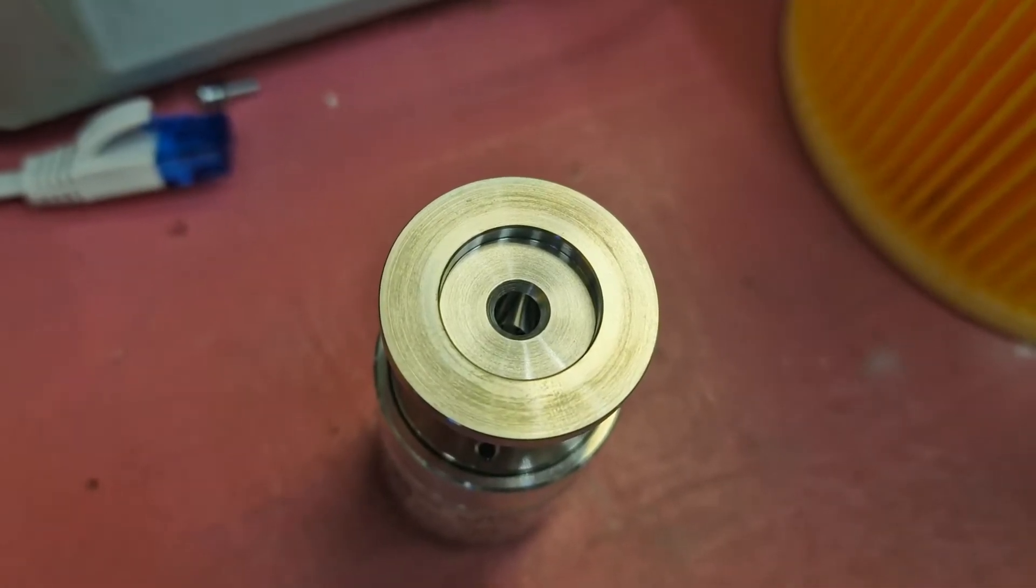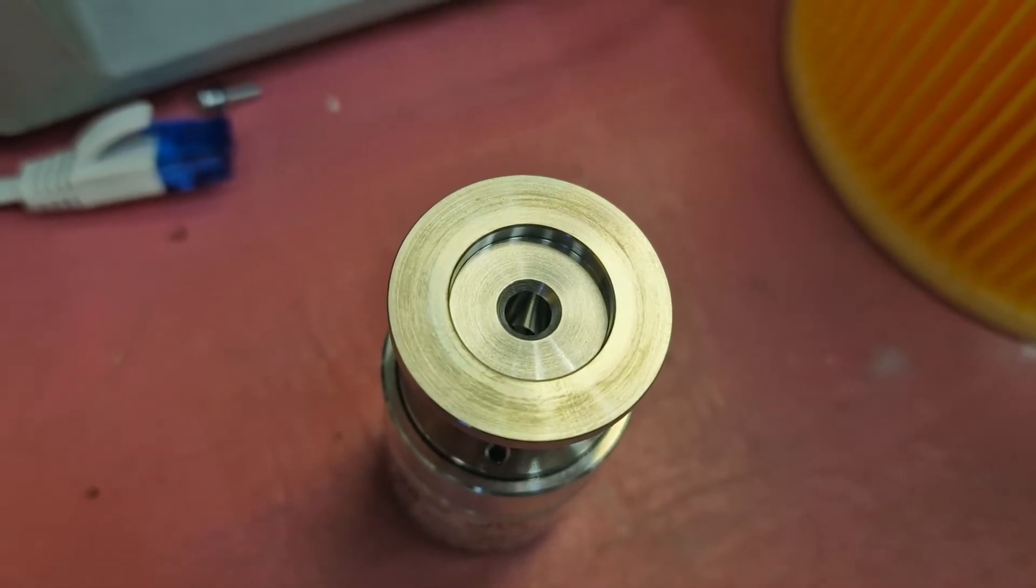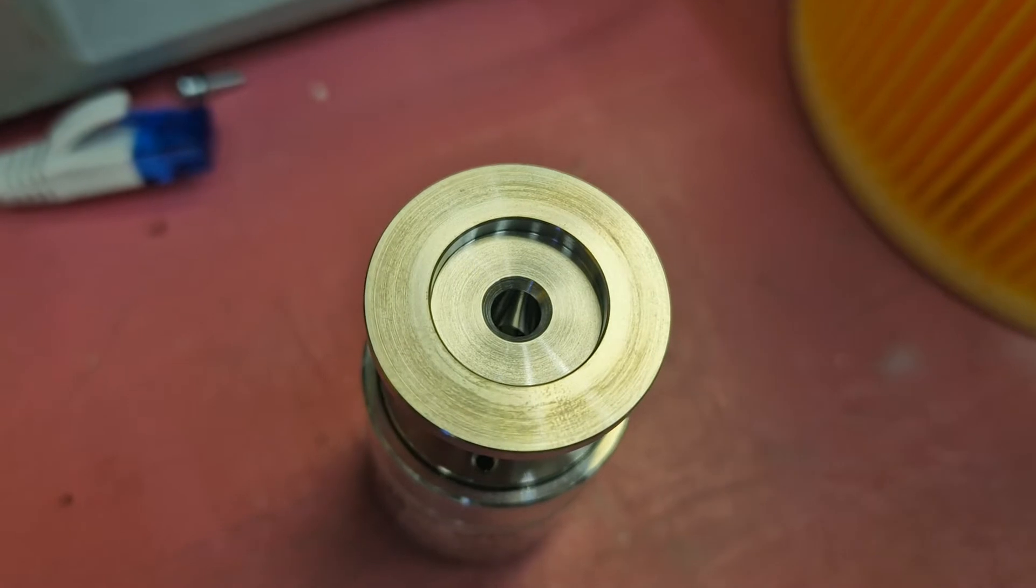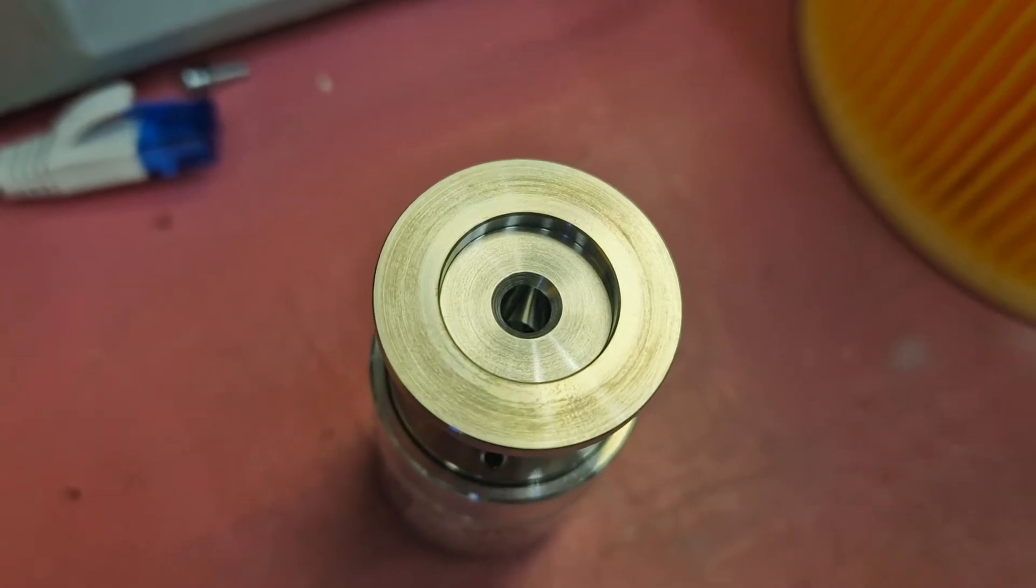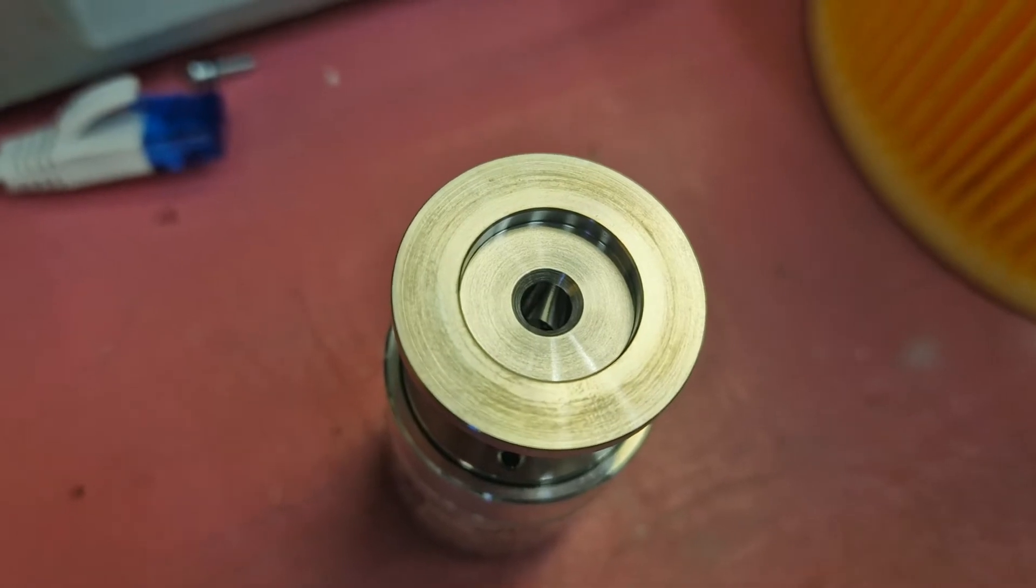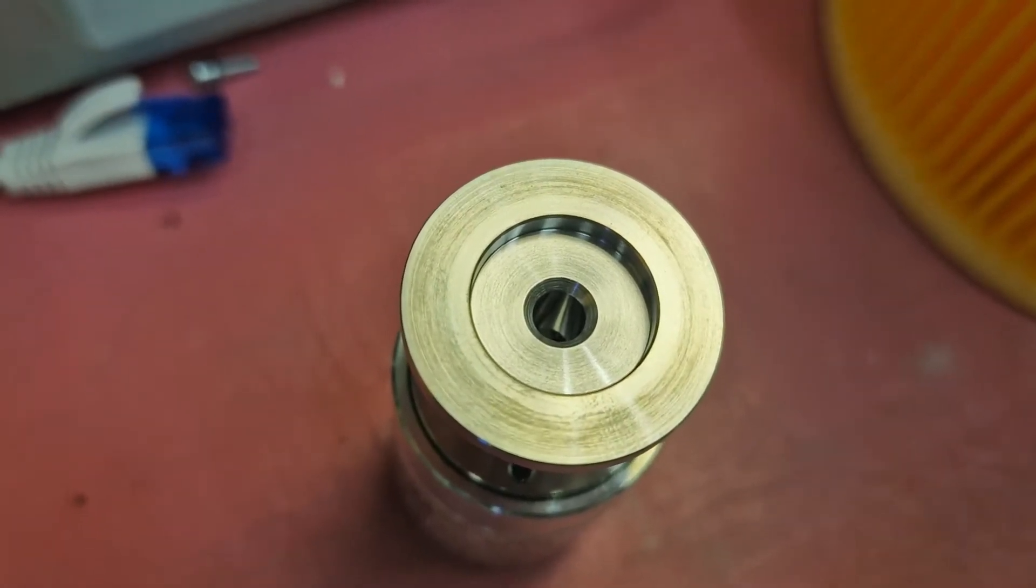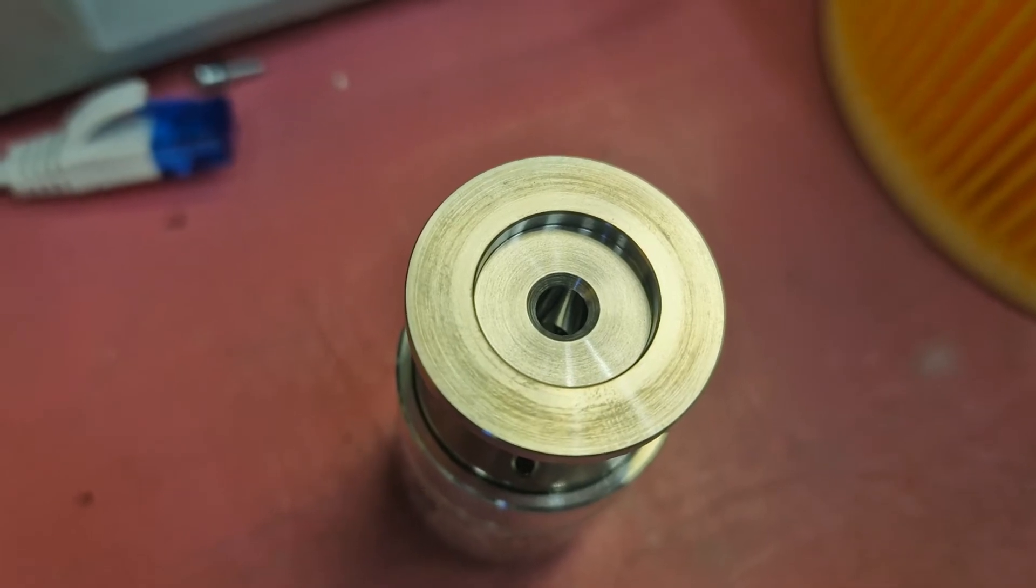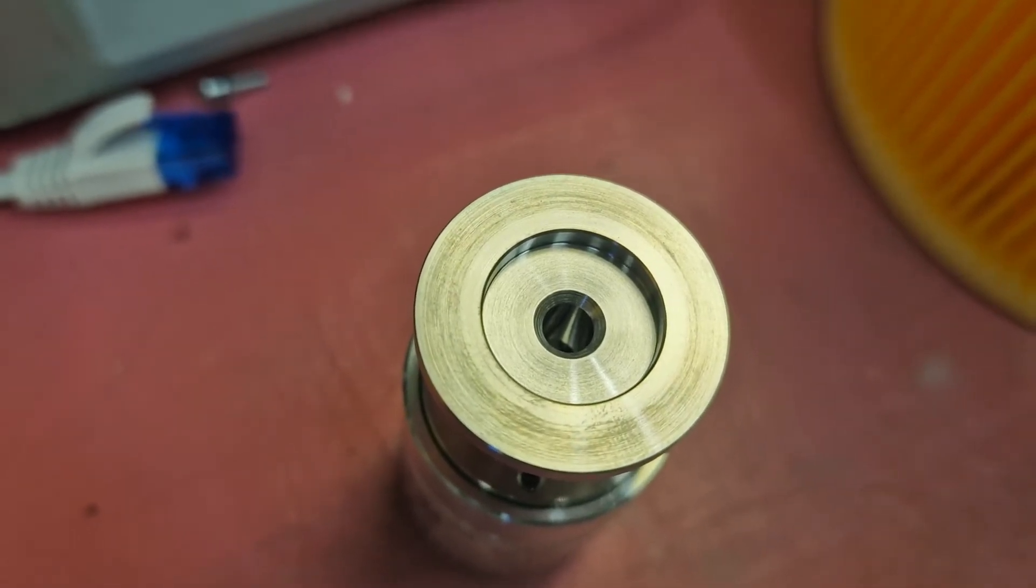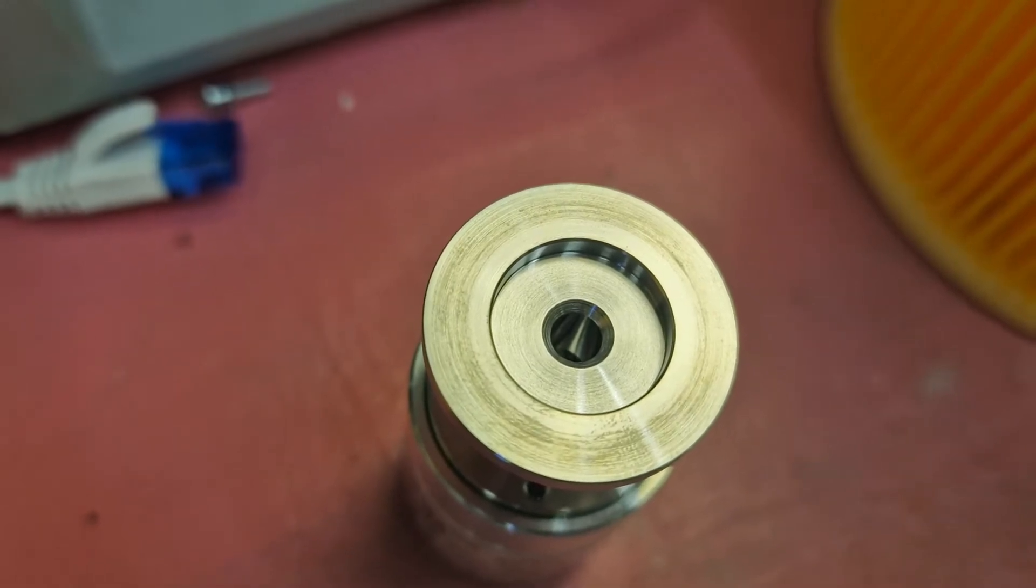One thing that can be done now is to use isopropanol and pour it into that little hole so it goes down to the actual sensor and shake it a little bit. Leave it there for one minute, take the isopropanol out, repeat it one or two times and then see if maybe it was just some dirt on the sensor that interfered with the readings.